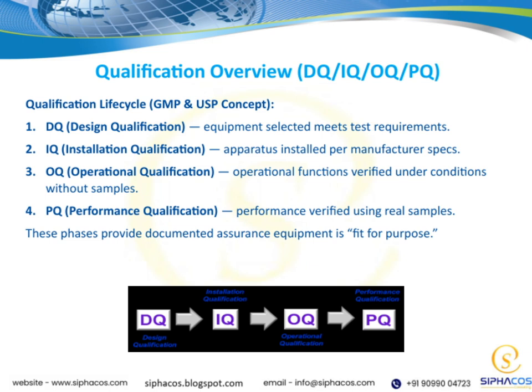All these steps form a life cycle that helps us manage quality systematically, aligning with GMP and USP concepts, and ultimately supporting our goal of delivering safe, effective products.